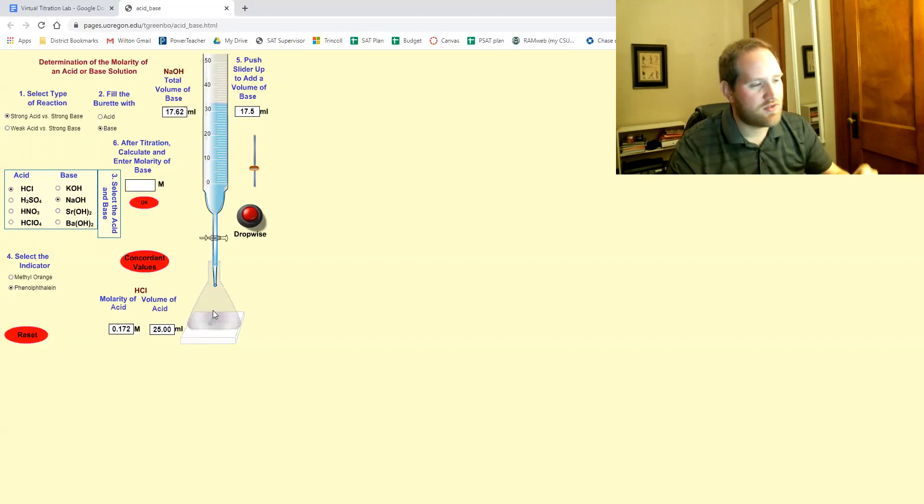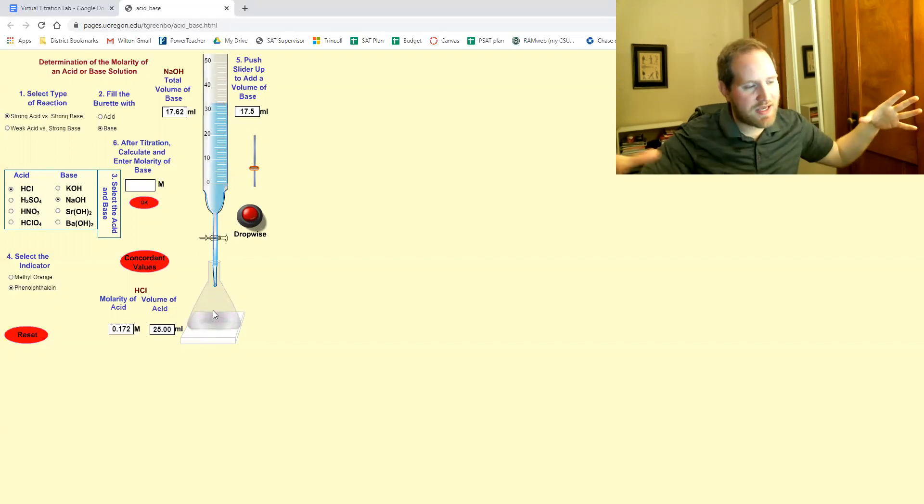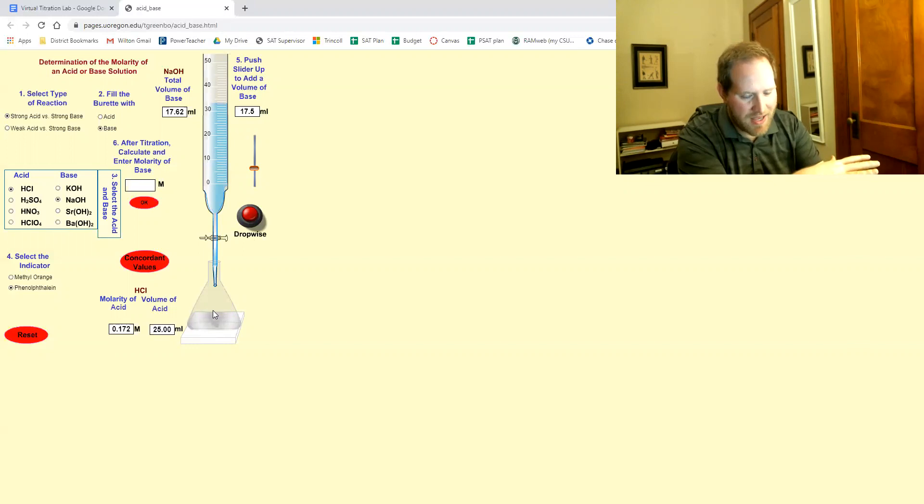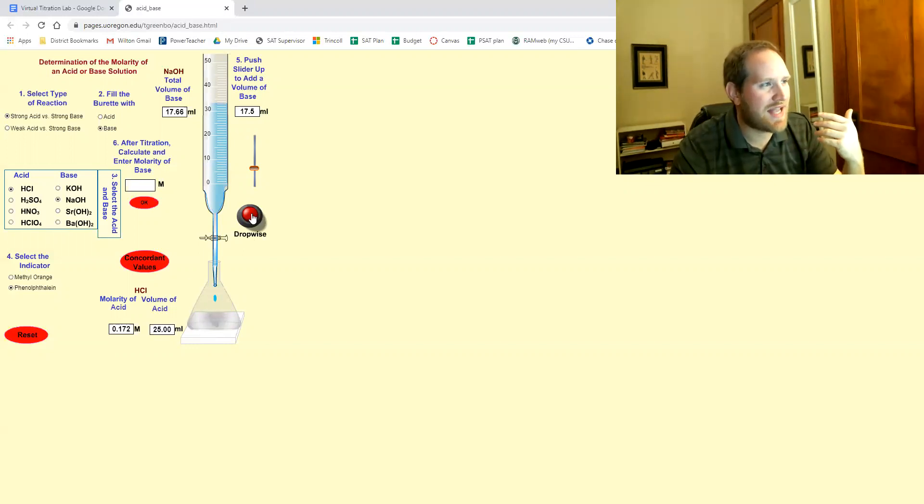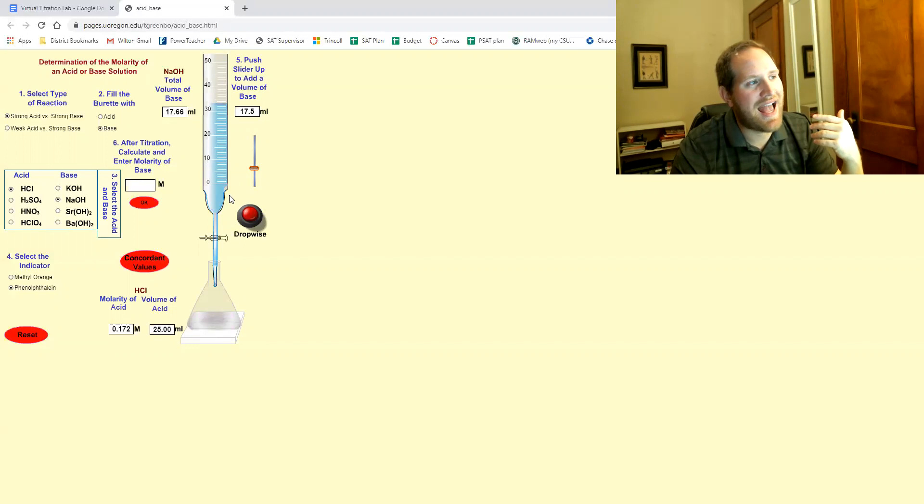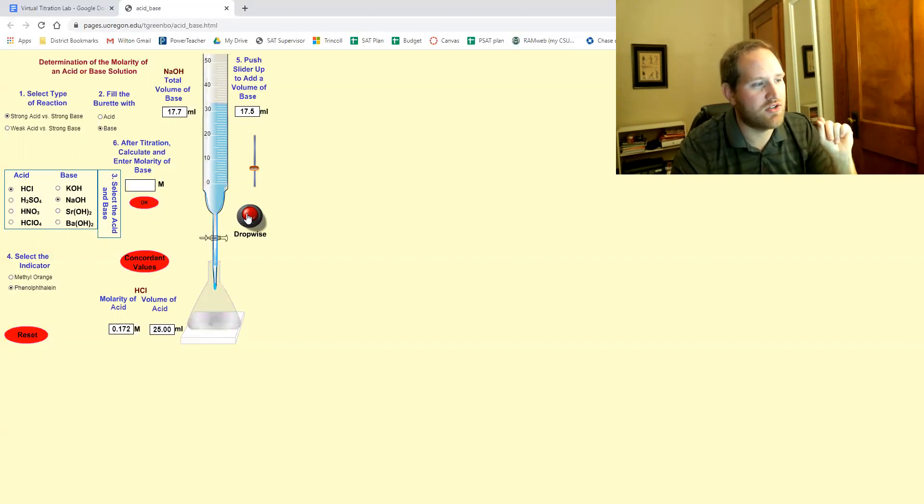And as long as it keeps flashing pink, but then fading back to clear, you keep adding it. Now you see what's happening up here. It's adding 0.02 milliliters every time you add a drop.